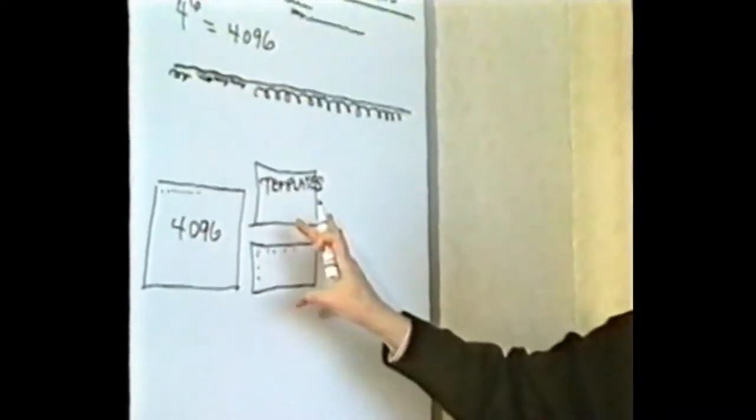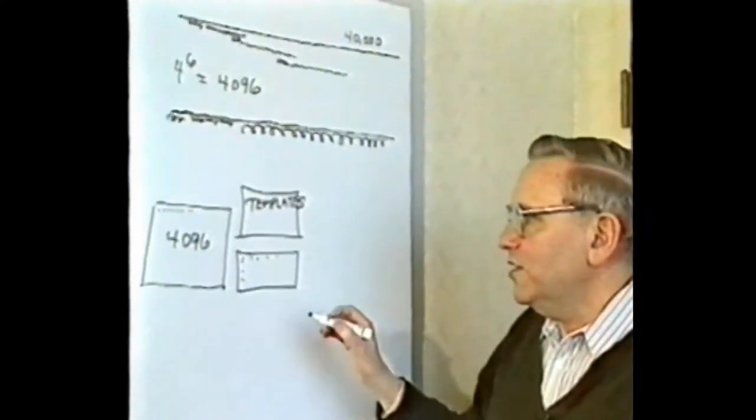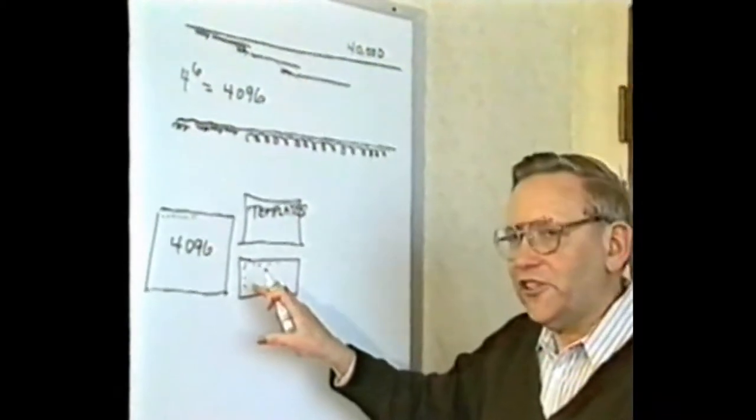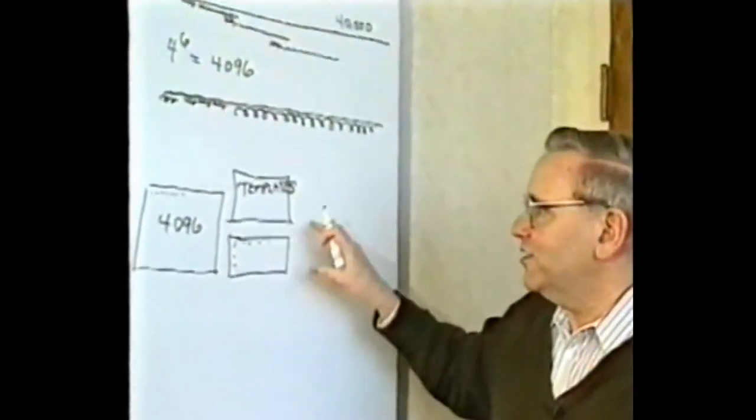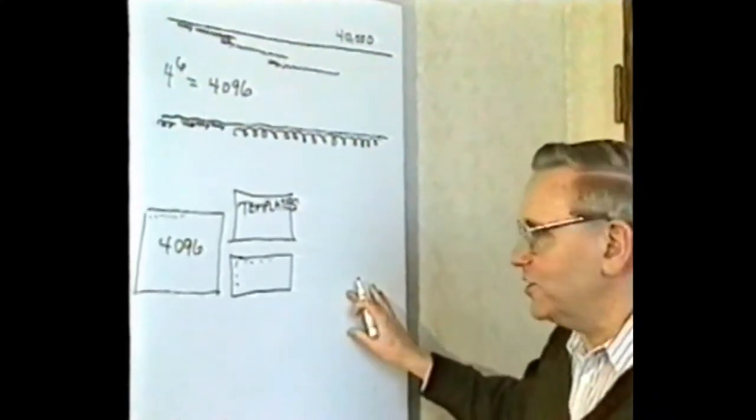This ability to assemble sequence reactions then means it would saturate any currently available capacity for analyzing the sequencing reactions and reading out the sequence. So designing a system that can read sequences as fast as the hexamer method can generate sequences is another challenge for the group. Currently, they're developing a capillary-based system that would be faster than gel electrophoresis.